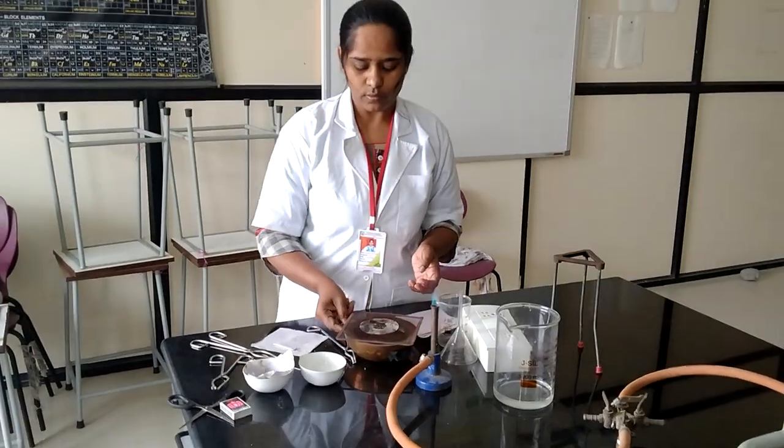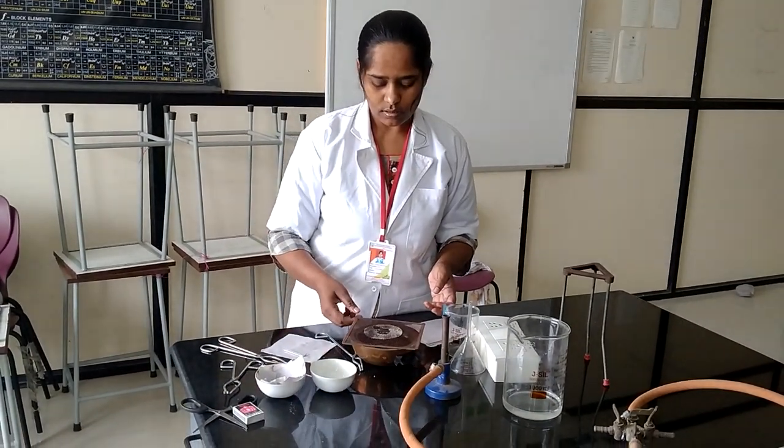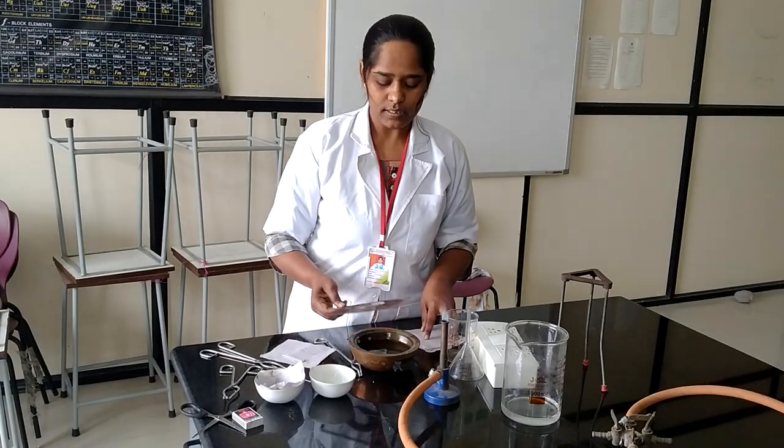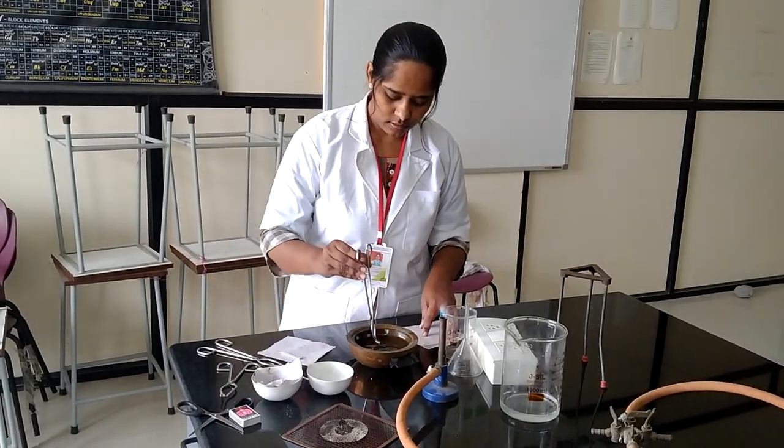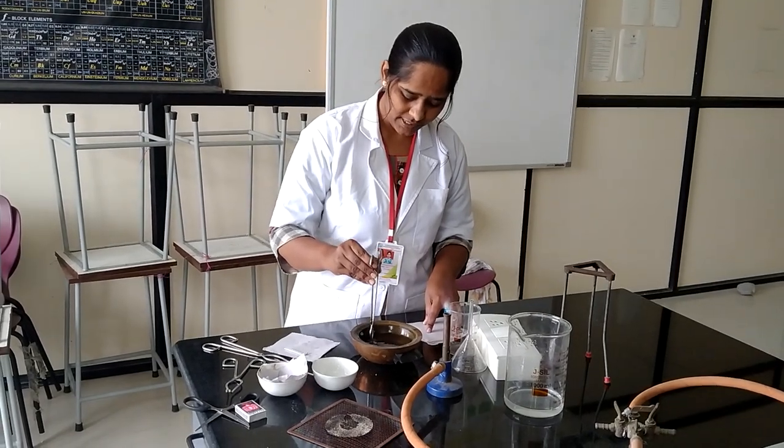Be careful during this step. Sodium metal is very explosive when it comes in contact with water, so we need to take care here.